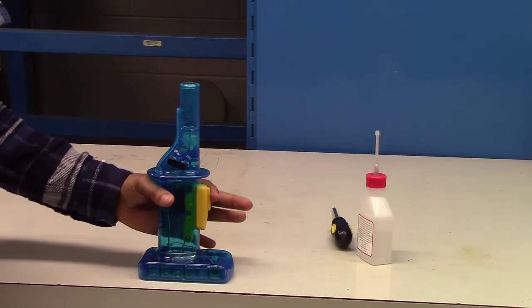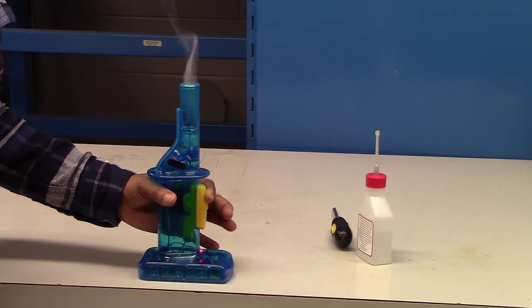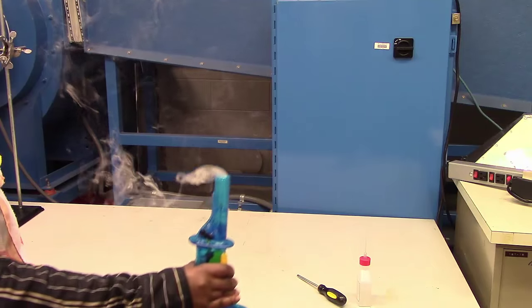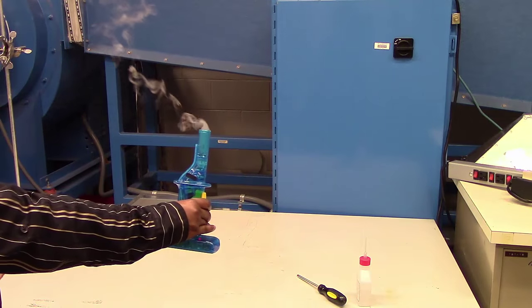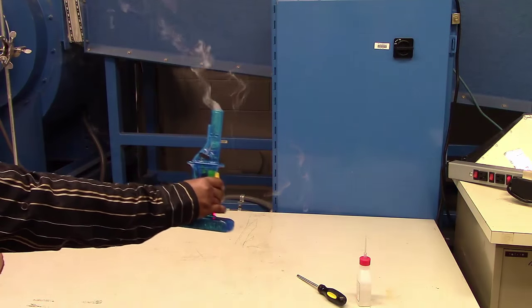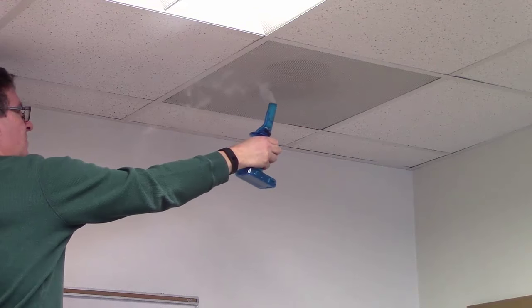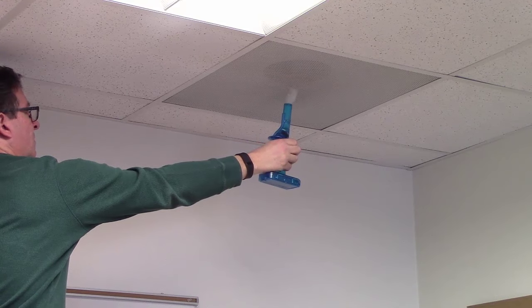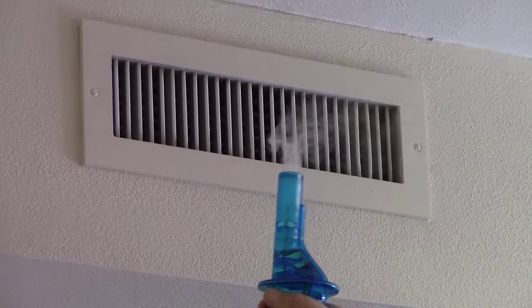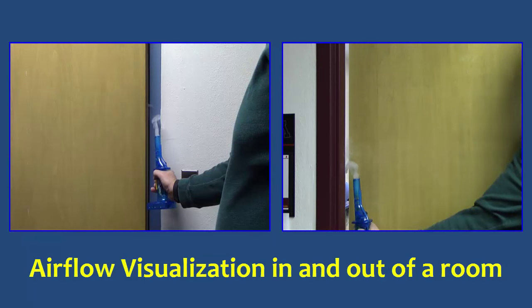To operate the wizard stick, press the first or top trigger for a few seconds to activate the vapor generator. Then squeeze the second trigger firmly to generate a steady stream of non-toxic fog. In calm or steady air, wave your hands to visualize the pattern of the fog in the room. To see the direction or path the fog takes, use the wizard stick near operating vents such as exhaust air vents or supply air vents. You can also place the wizard stick near cracks indoors to see how air is moving in or out of the room.